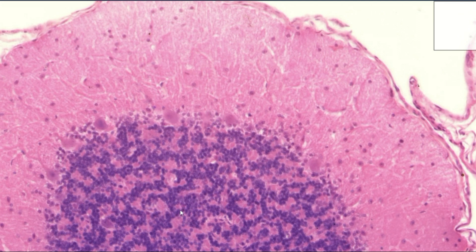The innermost part of the gray matter is the darkest because of the most numerous cells in the whole CNS — the granular cells. You can see these tiny rounded cells. Between the relatively small rounded cells we have some pale areas. These correspond to the cerebellar glomeruli, where compound synapses occur between the dendrites of the granular cells and the incoming mossy fibers, plus connections with the different processes of the Golgi cells.